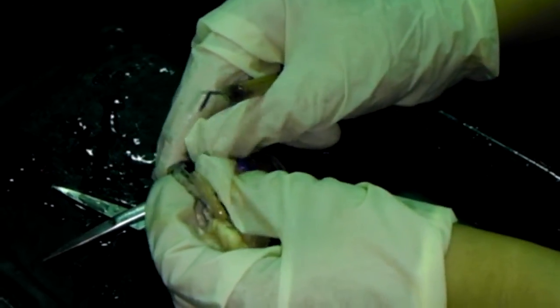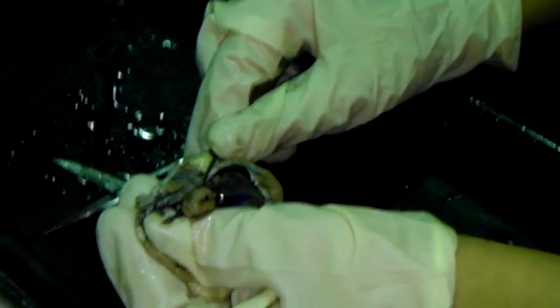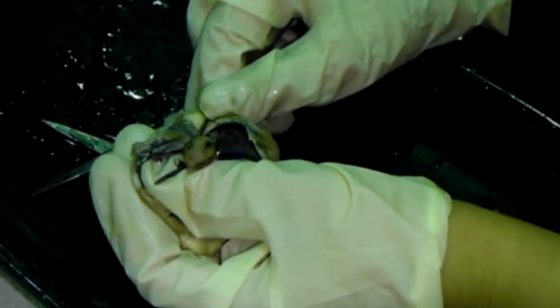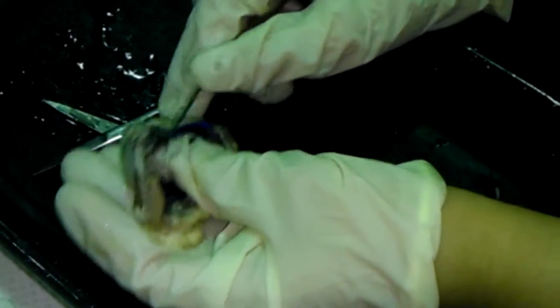This is the lens. When you have a cataract, what does it mean? The lens becomes clouded, it becomes blurred, right? You will see in the lecture that the lens mostly consists of the protein that we call crystallin. The lens is normally completely transparent and it does not have any blood vessels. But when you have a cataract, it becomes cloudy and blurred. So that's why the vision becomes blurred. I think it's better to sit down.